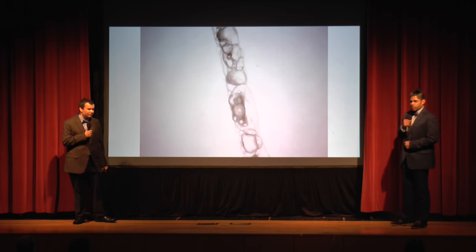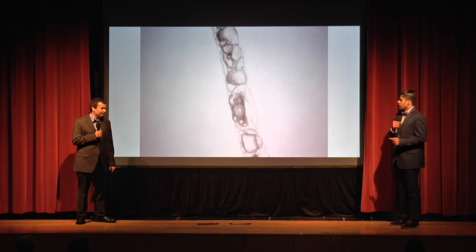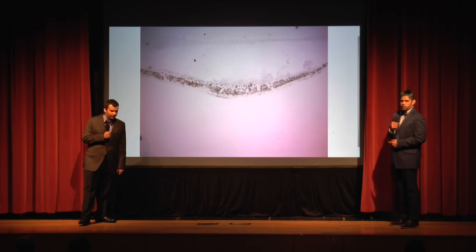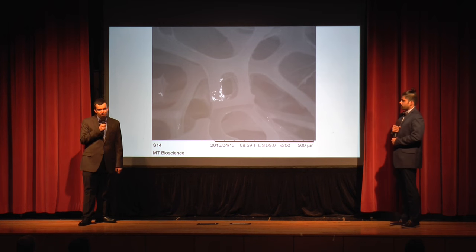We also did an experiment where we took a drop of water and let it dry on a glass slide. And then we placed it under this microscope, and what we found was the ring for the actual pond water is a lot bigger than the ring for the filtered water. We also took SEM images of our films.